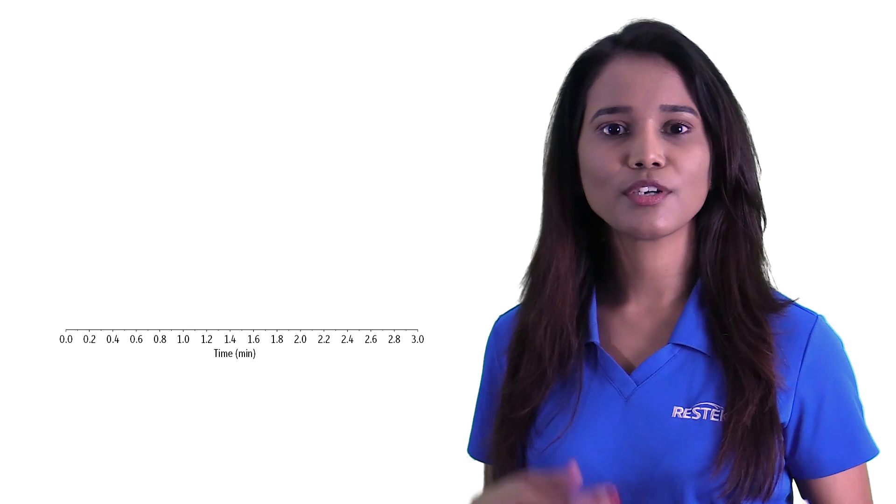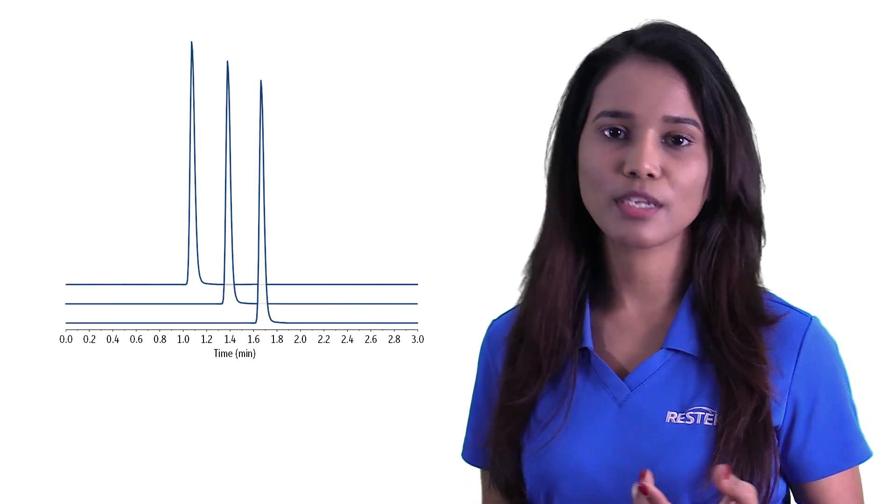Retention times must be reproducible from run to run. When problems occur, late, early, or variable retention times may be observed. Let's say we are doing some liquid chromatography and we start seeing retention time shifts over subsequent runs.